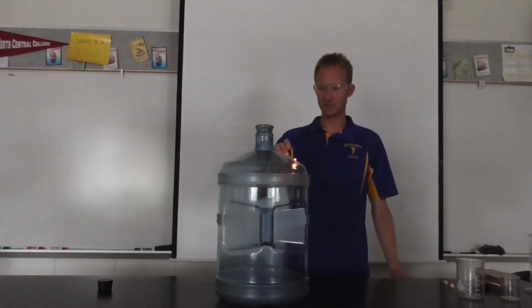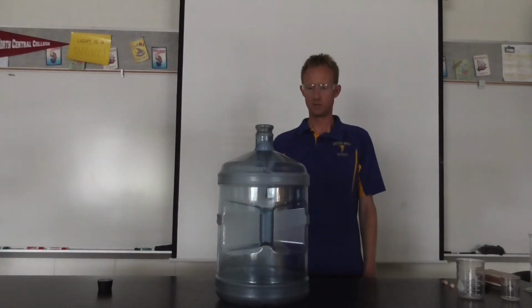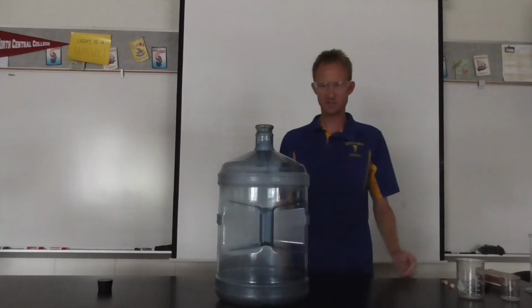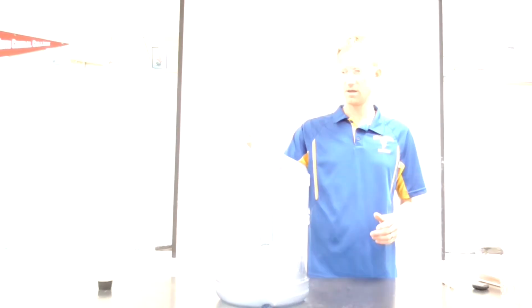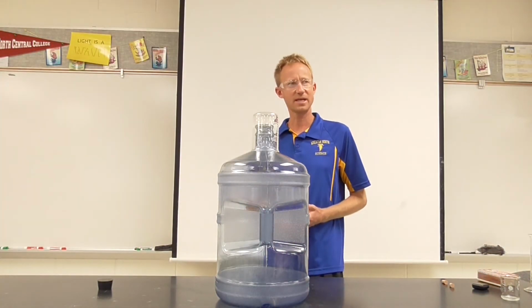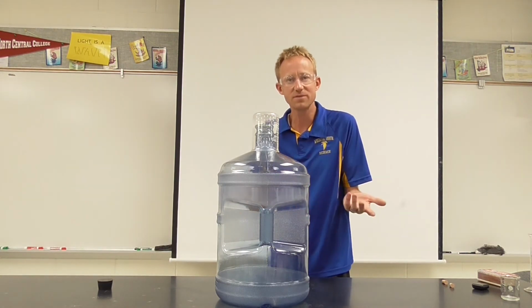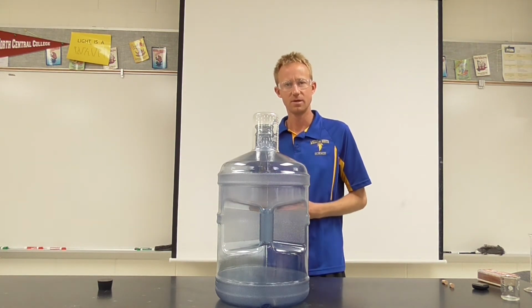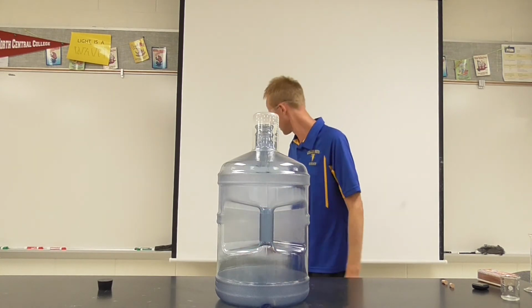Okay, let's combust the methanol. Oh boy, that's surprising. It really didn't do much at all. The first time we put 10 milliliters in and got quite the explosion. And the second time, it appears that nothing really happened, just a little bit of flame. So let's go to the equation, and maybe that can reveal what has happened here.